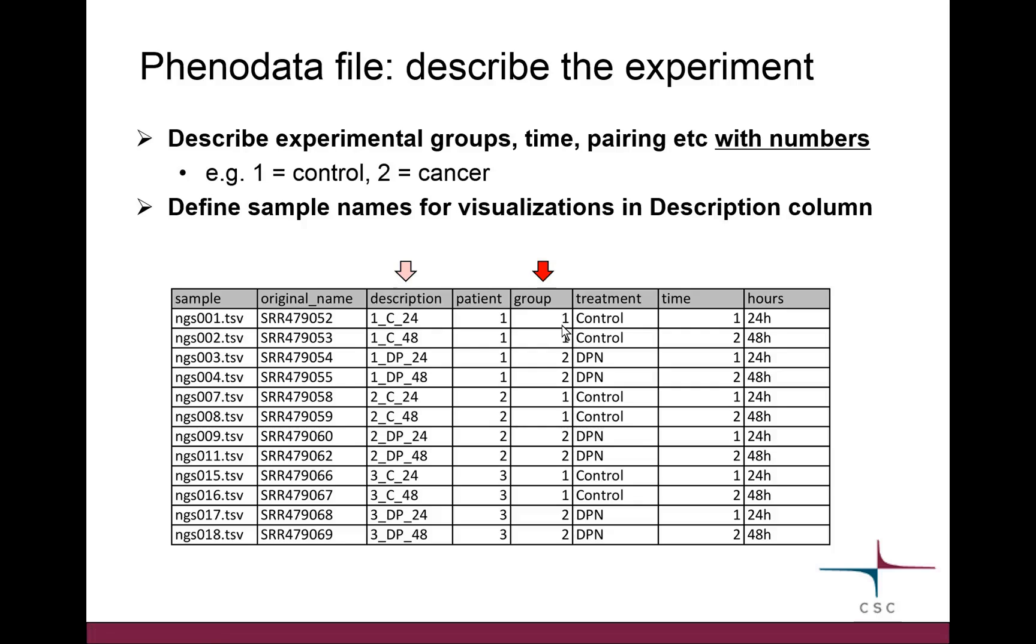If you wrote text here, say your groups were control and cancer, that would work. Chipster wouldn't complain about it, but it would calculate the fold changes the wrong way around because it would just take those words alphabetically. Cancer with 'ca' is before control which is 'co'. So that's why to be on the safe side, it's better to use numbers here. Of course, you are most welcome to write extra columns for yourself to remember. In my case, my groups are my treatments: control treatment and DPN chemical treatment. This is just for myself to remember what the numbers are.